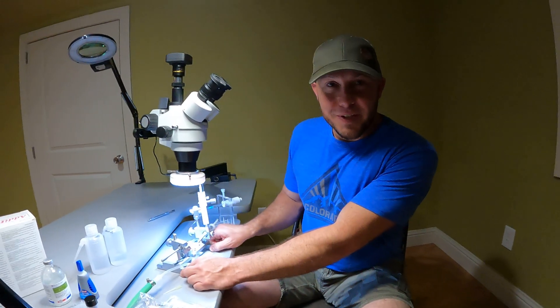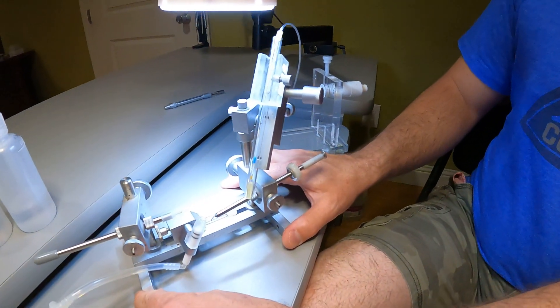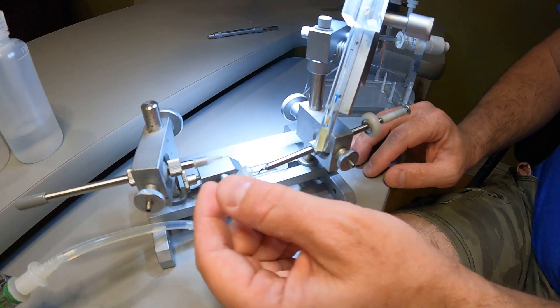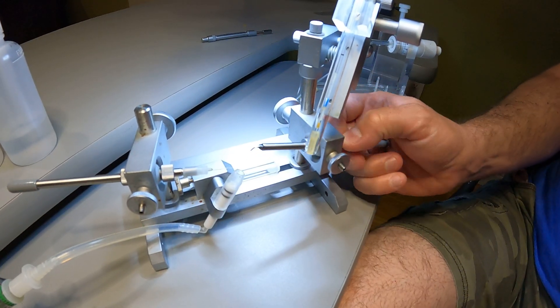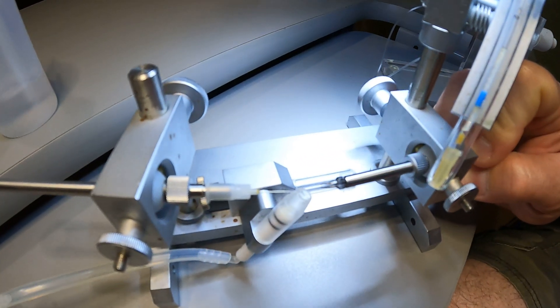The centerpiece here is the Schley. It was designed and made by Peter Schley. You can see the ventral hook — everything's adjustable. These are pressure grips, and that's what's used to grab her stinger.